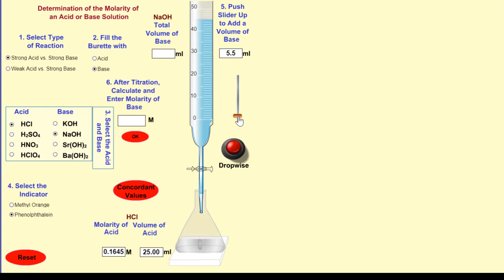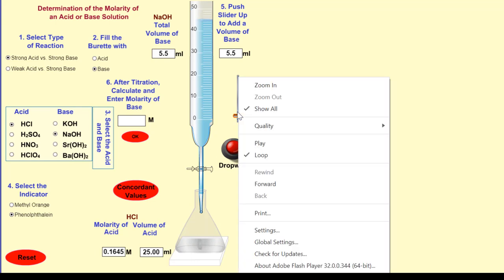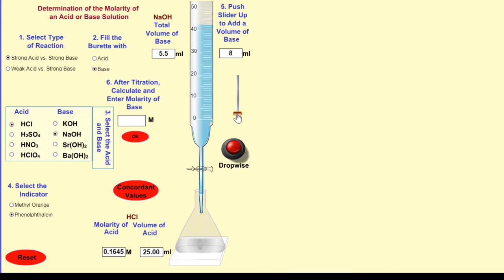So let's put some volume in. Let's put 5.5 milliliters in. Put a little bit more in. 8 milliliters. 10.5. 14.5. Did you see that color change?